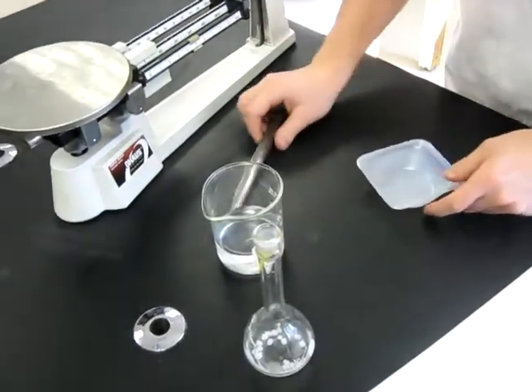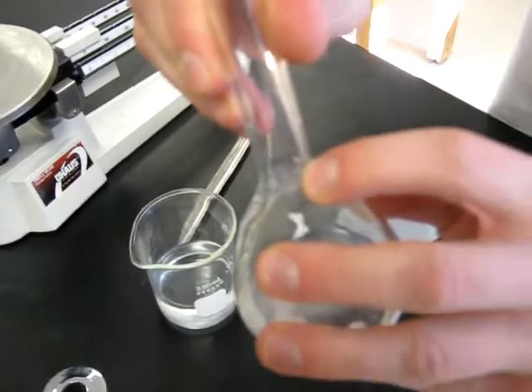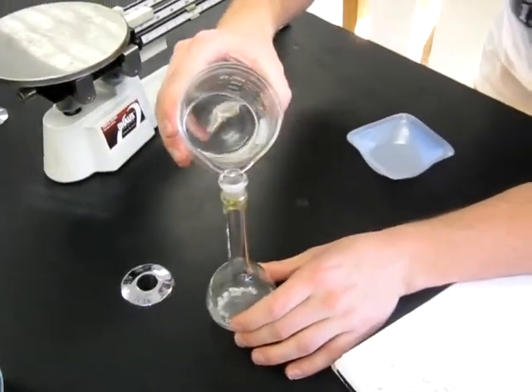Okay, so now that we have those in there, I'm going to go ahead and add more water until it reaches the 100 milliliter mark on the flask. We get 100 milliliters of our base for the titration.